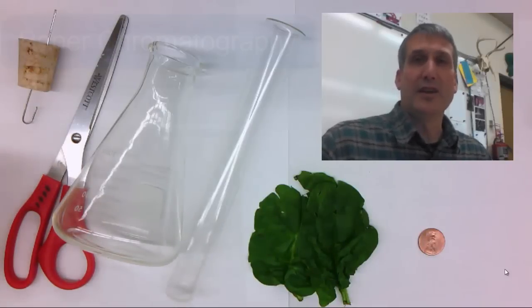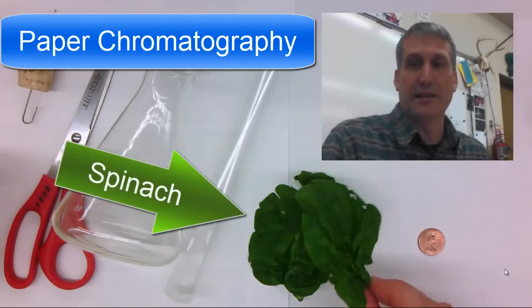Welcome aboard the Biotrain. In this video we're going to talk about paper chromatography and the paper chromatography lab that we do to separate the pigments found in spinach leaves.